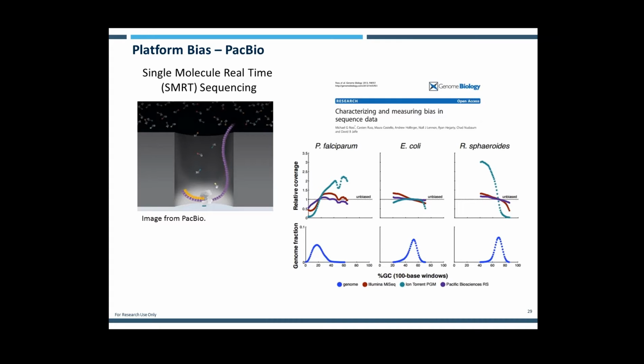And so here the active polymerase is immobilized at the bottom of what's known as a zero-mode waveguide, or ZMW. And so then as fluorescently labeled nucleotides are diffused into the ZMW chamber, you have illumination directed to the bottom of the ZMW, and the nucleotide that's held in that polymerase prior to incorporation emits its extended signal.